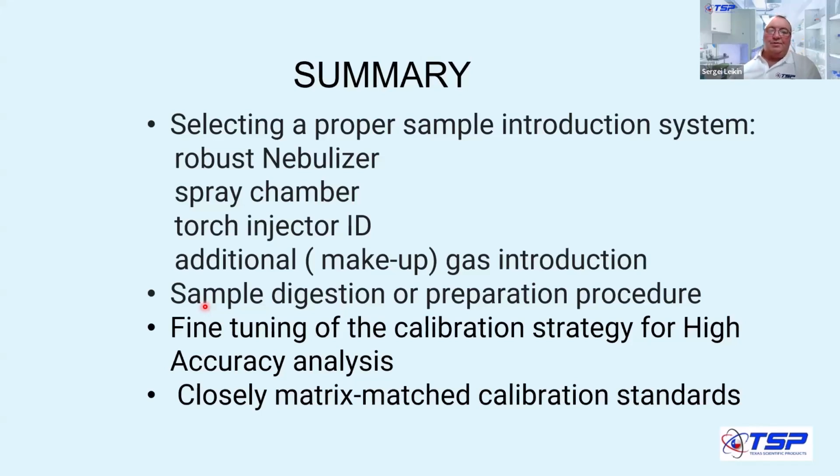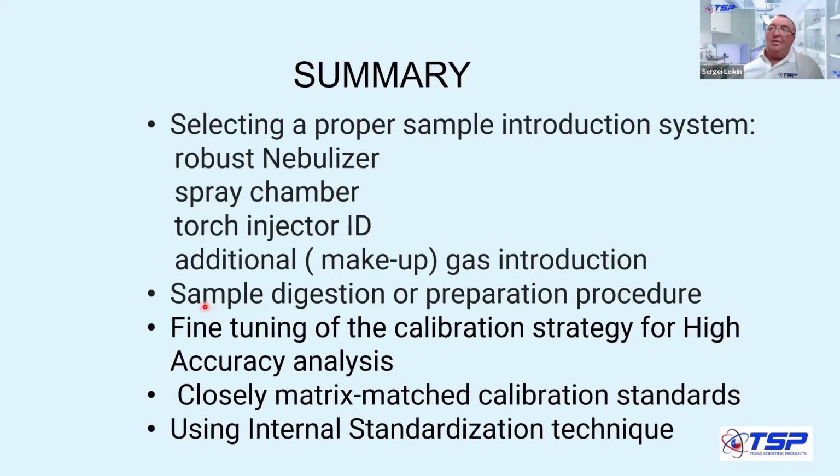And then, of course, closely matrix matched calibration standards, which I showed with a few examples. But this part, I think Michael will continue on that.